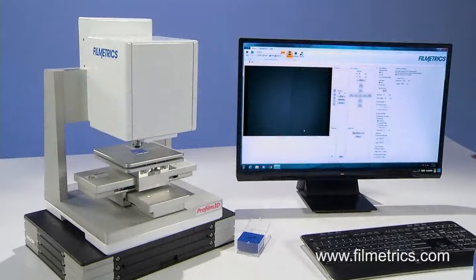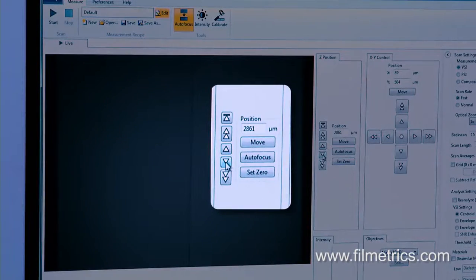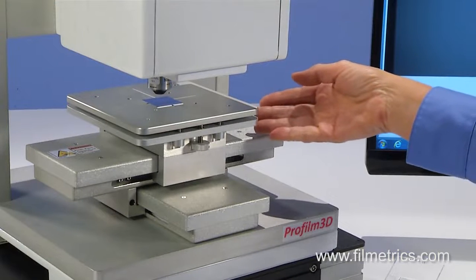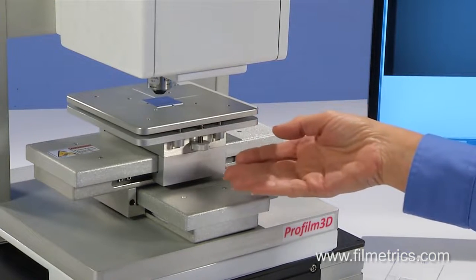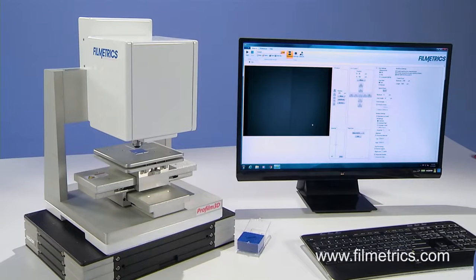First, check to see that the interference fringes are suitable for making a measurement. This is done by moving the Z stage up and down to focus. If the fringes were not suitable, the tip-tilt stage would need to be adjusted until the fringes are correct. In this case, the fringes look good.